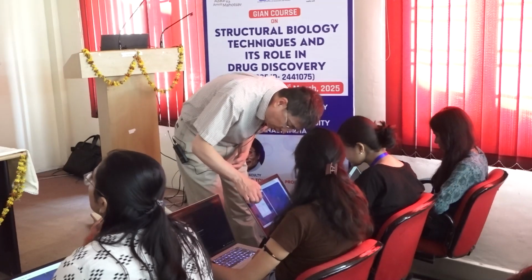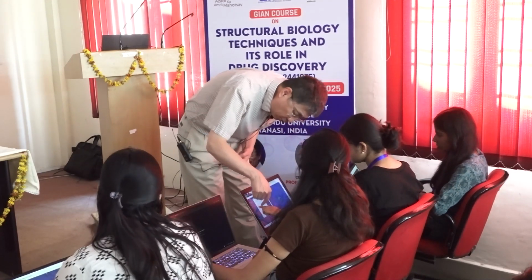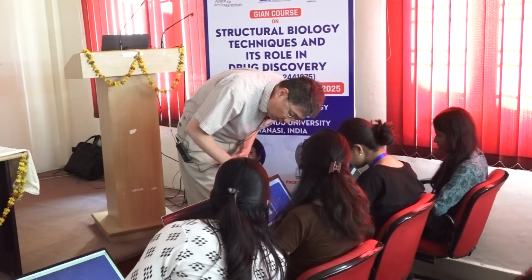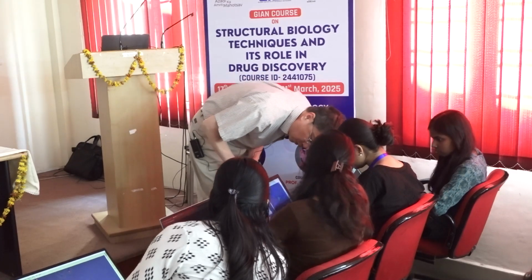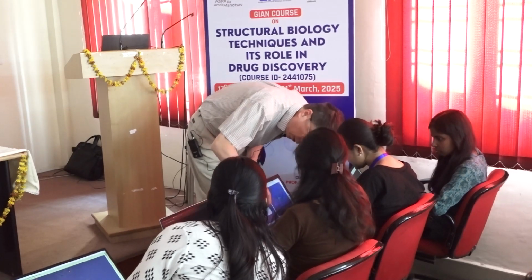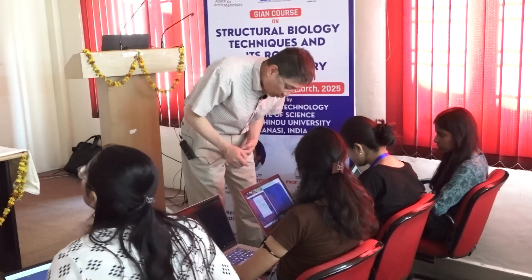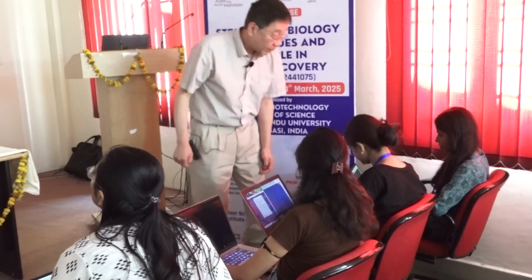No. Residue 2, not chain 2. Chain is Z. Use the drop down menu. Click on this arrow there. This one. Okay? And then you see 2 there. Click on that. You see 2? This is 2. A2, yeah, A2. Click on A2. Yes. And then say accept. There you go. Okay? Right here. Yes. Okay?